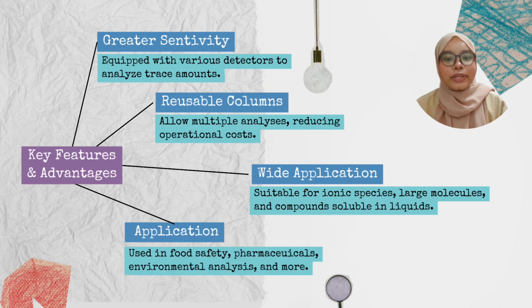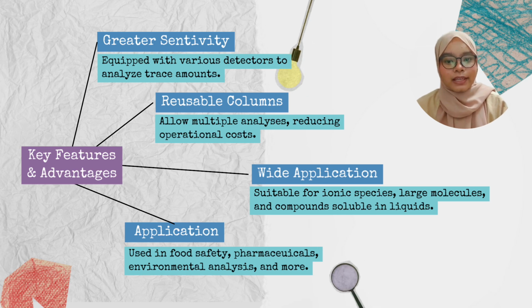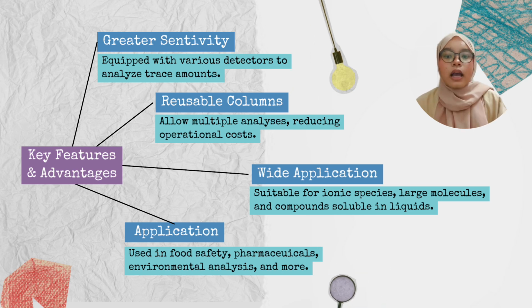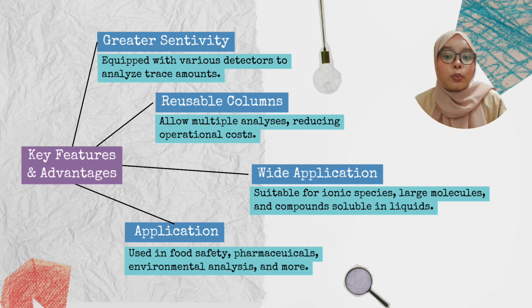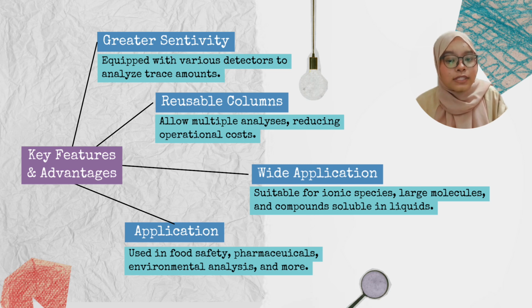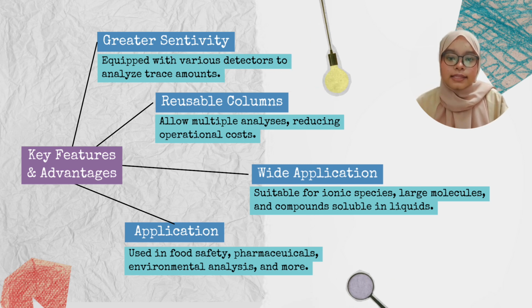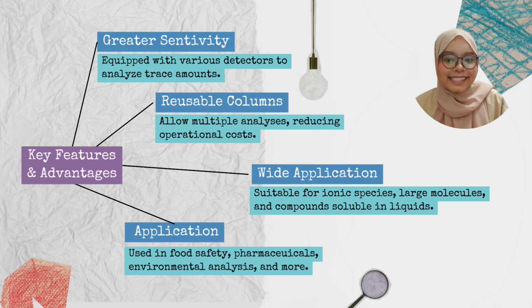Now I will explain about key features and advantages of high-performance liquid chromatography. Let's get started. Our first feature is greater sensitivity. HPLC is equipped with various detectors, allowing it to analyze even trace amounts of substance. This makes it incredibly reliable for precise analysis.